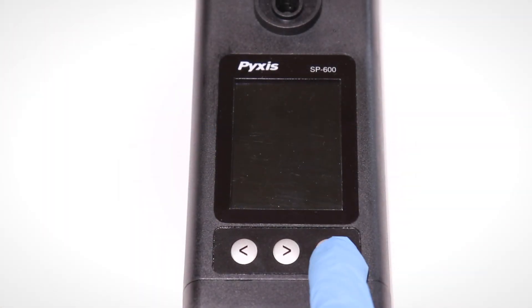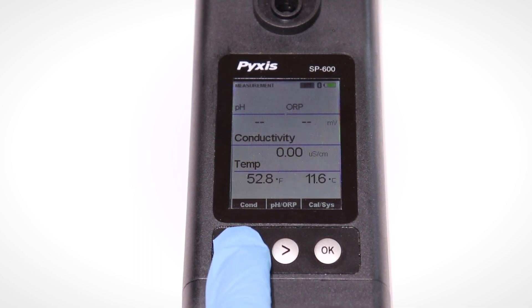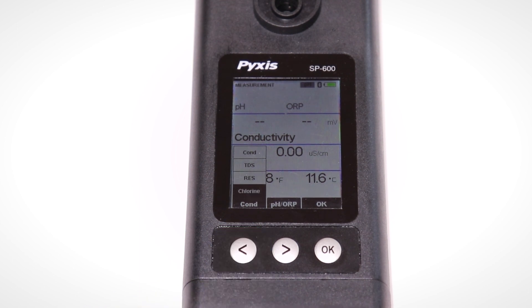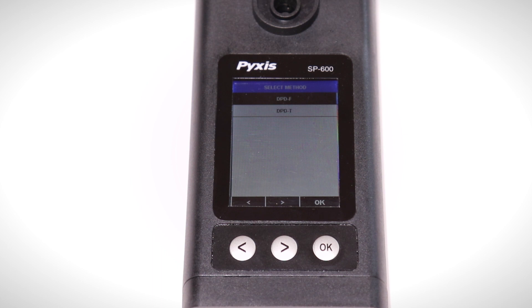Press the OK button to power on the unit. Then press the left arrow button to navigate to chlorine. Press the OK button to select chlorine. Use the OK button to select either DPD free or total chlorine.